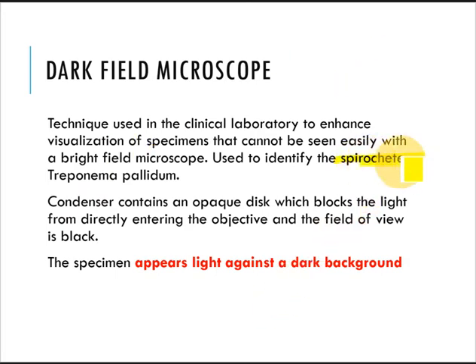This is your Treponema pallidum. Guys, are you familiar with this bacteria? Treponema pallidum. Yes, ma'am. So your Treponema pallidum is the causative agent behind the very well known STD or STI now. It is syphilis. Patients having syphilis usually exhibit chancres in their genital areas.